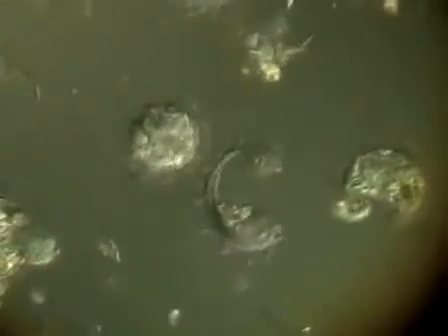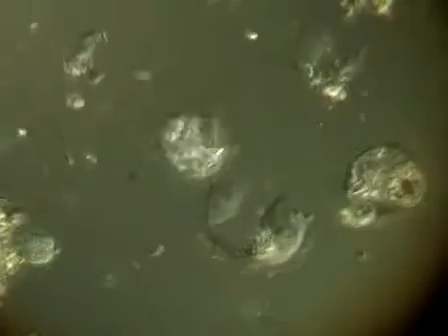We also have the capacity to do something called DIC microscopy, so differential interference contrast, which, as opposed to giving you contrast in terms of either white and black or sort of dark and gray, gives you more of a lunar landscape type of edge contrast, in the sense that if you look at the moon with binoculars it's all gray, but when you focus it, you'll start to see edges very nicely.